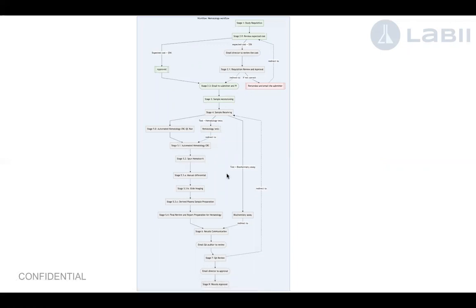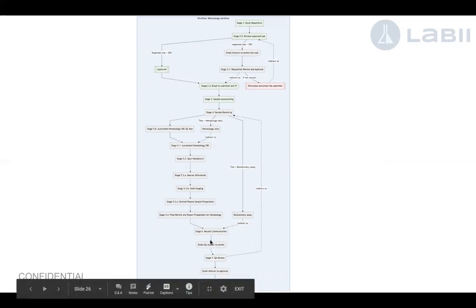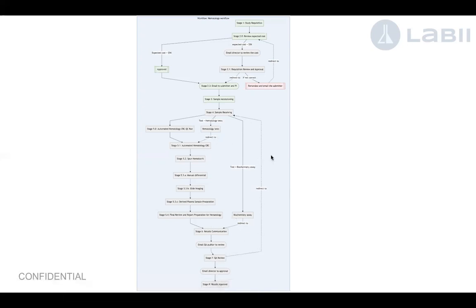So every single step has its own functions associated with it. If data needs to be approved, for example, it sends out an email to the QA auditor to review. When the QA auditor receives it, they need to review it. If it does not pass, we need to go back again. So all of that you can build to manage the whole complete workflow inside your lab.